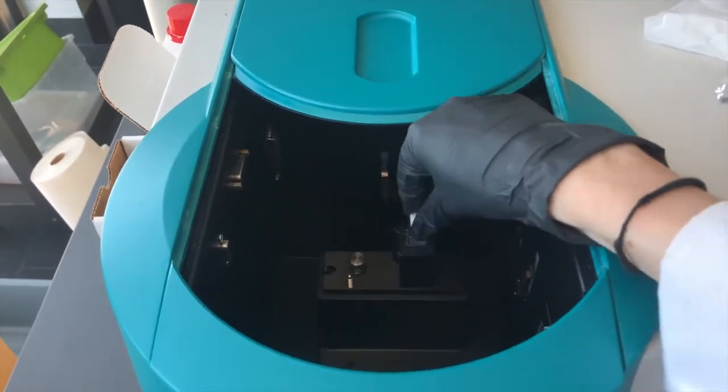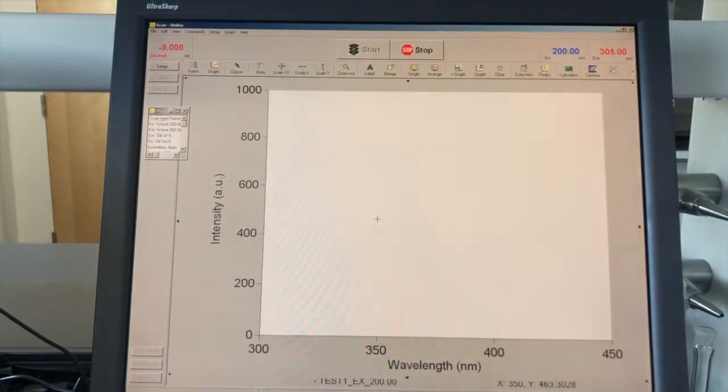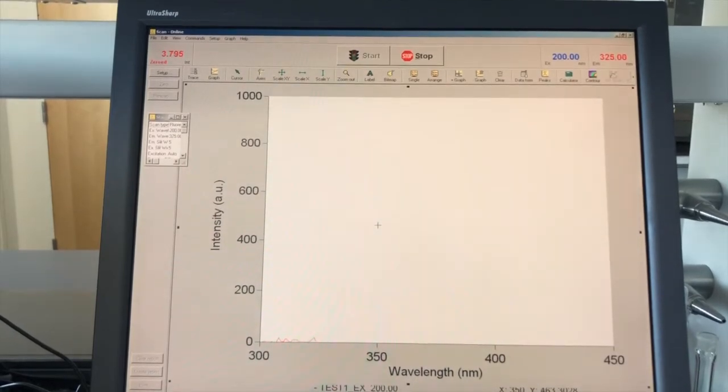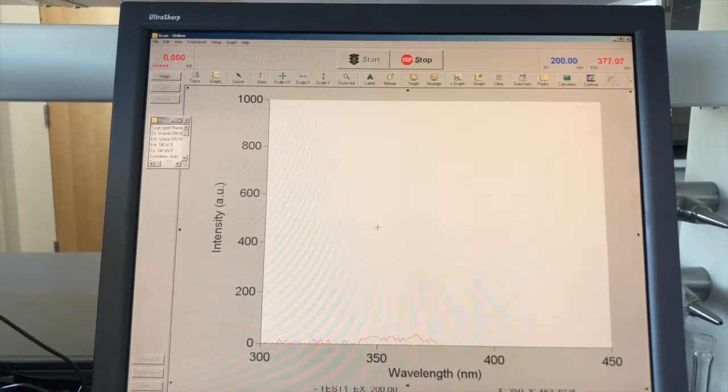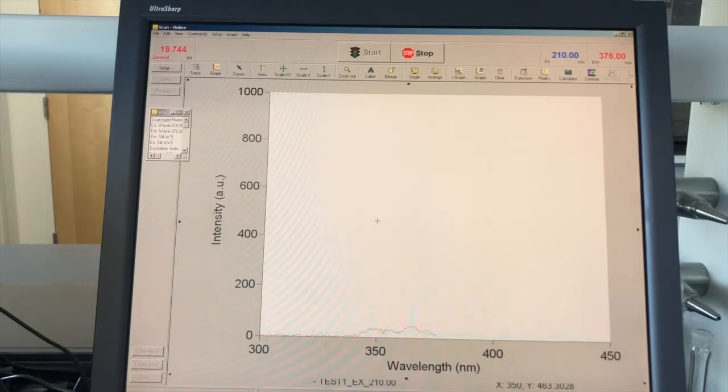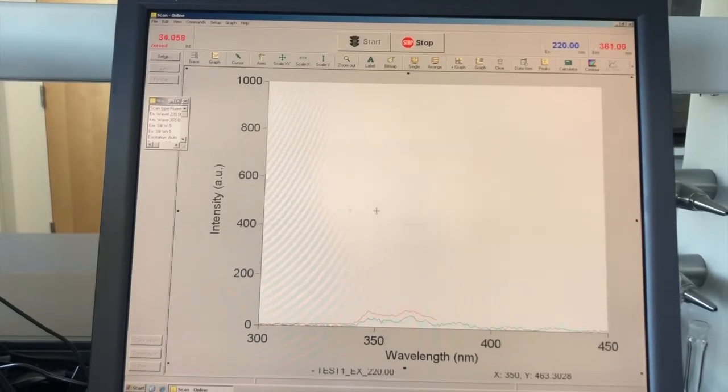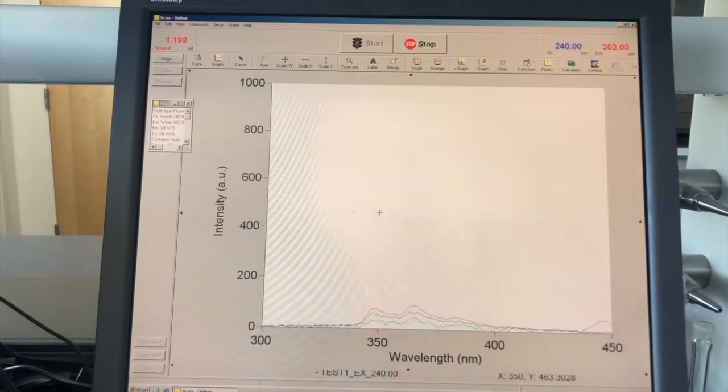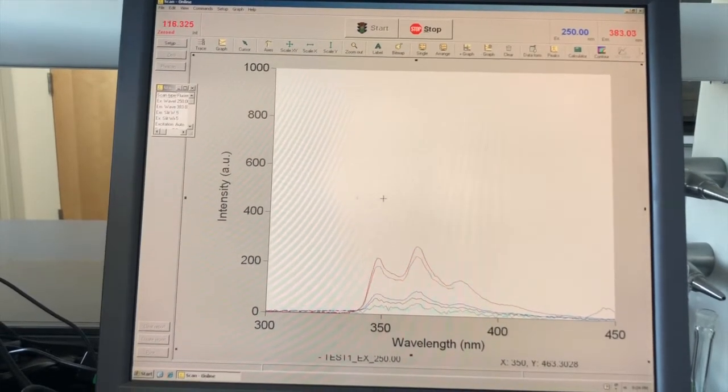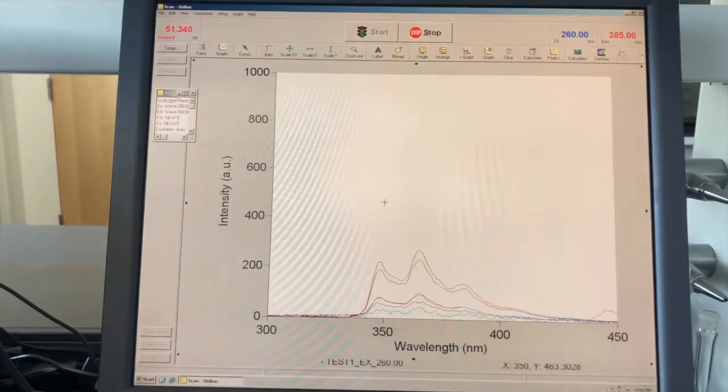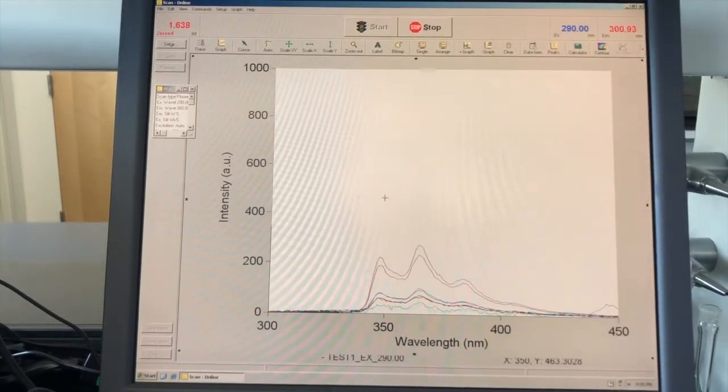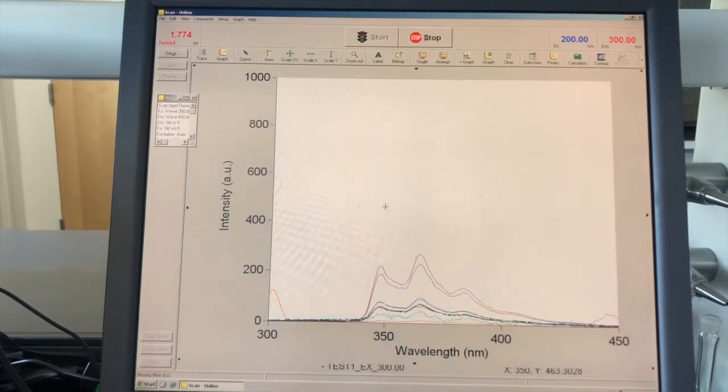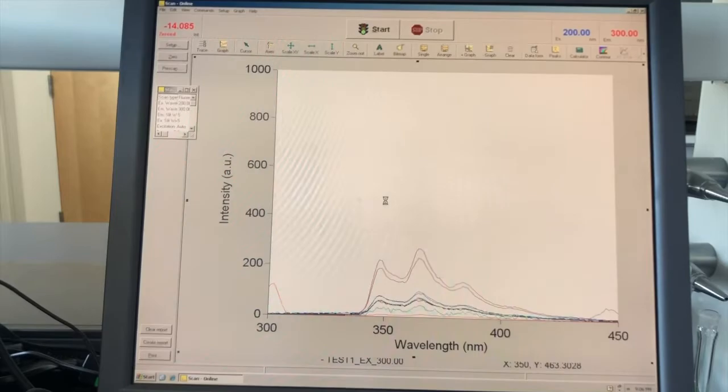Here I'm using a Varian Cary Eclipse instrument and I already input my scan parameters so I've started the scan of my sample. What's happening here is I'm exciting my sample over a range of excitation wavelengths and then collecting emission data over a range of emission wavelengths and what I end up with is this spectra that is characteristic to the PAHs and PAH metabolites in the sample.